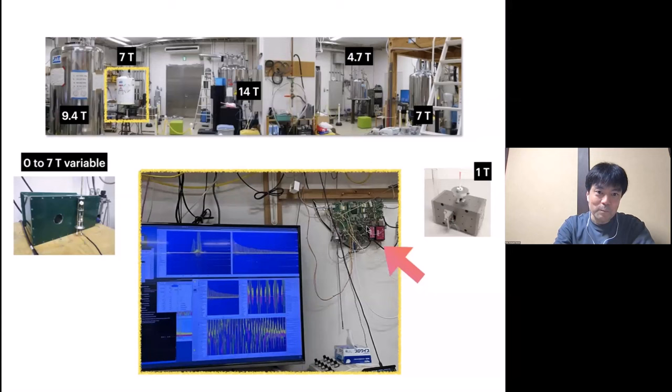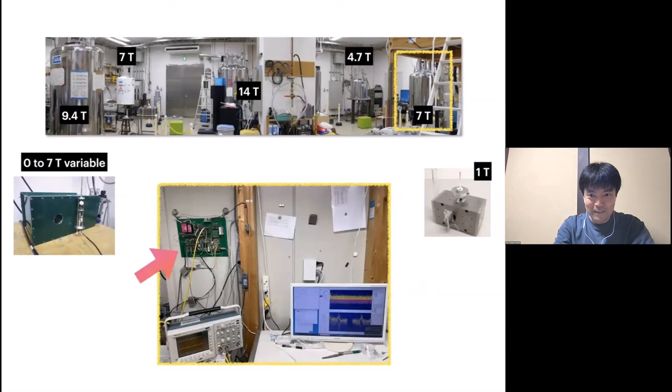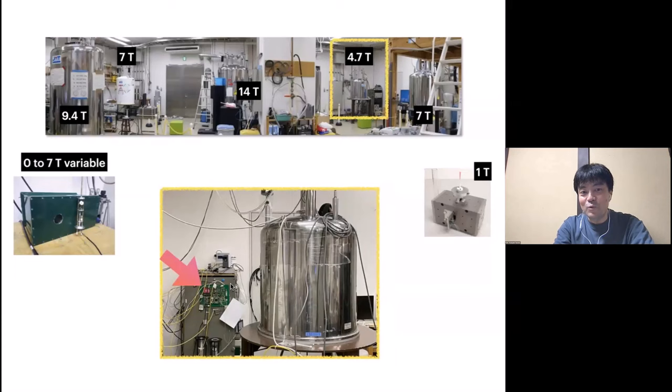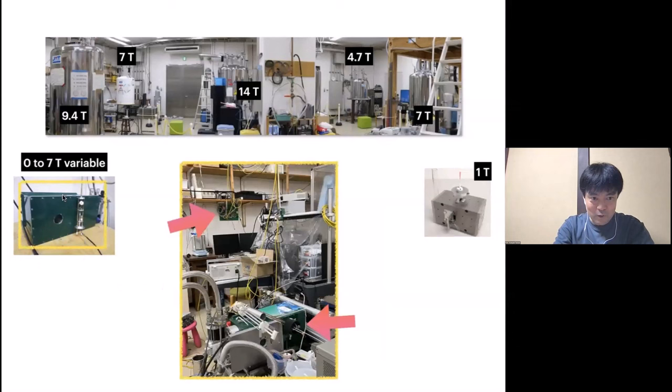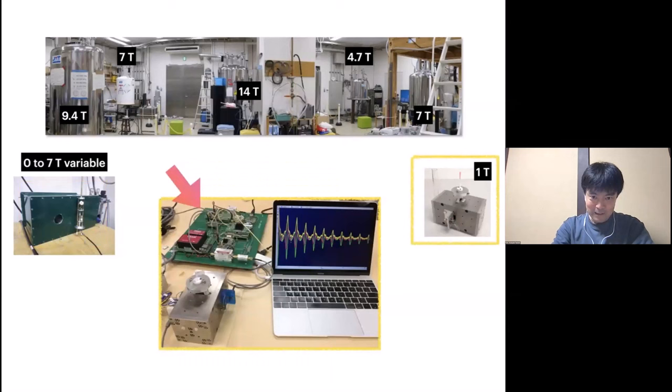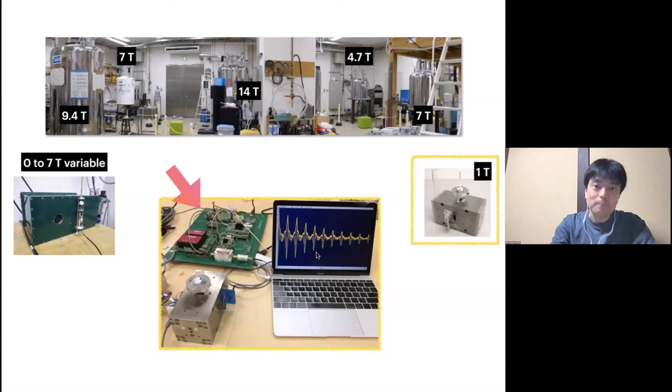This is the 7 Tesla NMR system, and another 7 Tesla — quite similar. And this is the 4.7 Tesla. We also have a somewhat special cryogen-free field-variable magnet dedicated for field-swept or field-variable experiments, and for this magnet we have another spectrometer hanging on the wall. Finally, we happen to have a permanent 1 Tesla magnet, mainly used for NMR toy demonstrations.